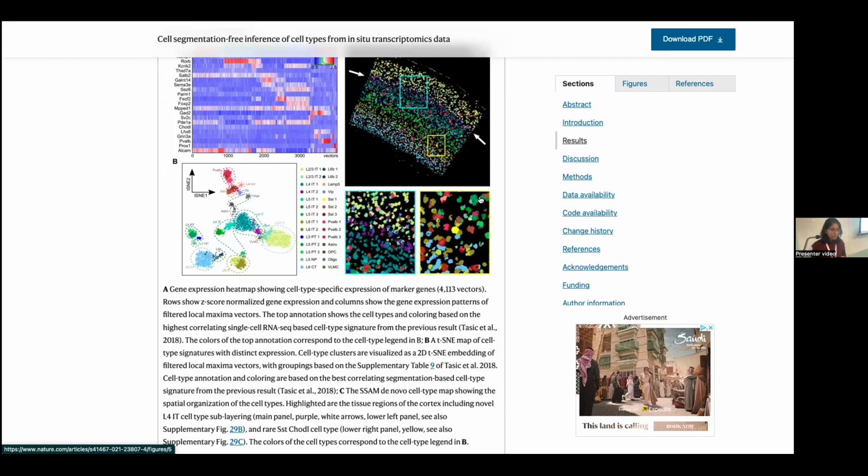So you actually can identify cells, but the cells are not real cells, they are pseudo-colored. If it's moving through a region that is acellular, it will just not map it. If it's moving through a region where there's a cell and there's some gene expression, it will map it up.